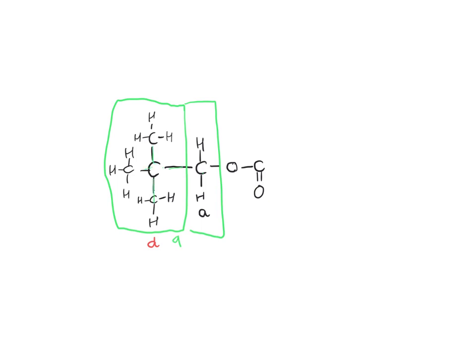And then on the other side of it, there are no hydrogen atoms, it's just an oxygen atom, so that gave a singlet. Then we have the ester link, and the ester was joined to an ethyl group and then a CH3, which gave rise to the triplet and the quartet. And there is our ester group, and there is the ethyl group.